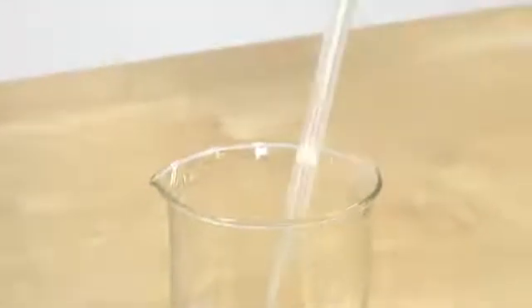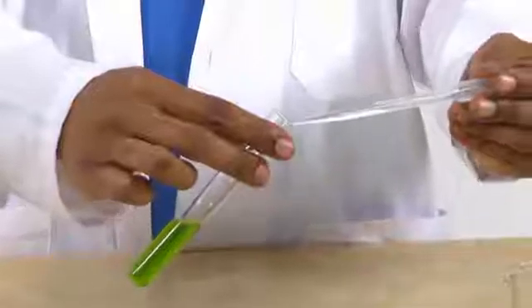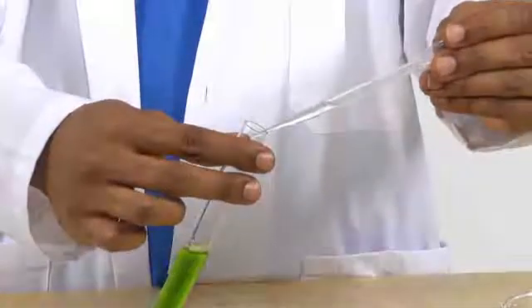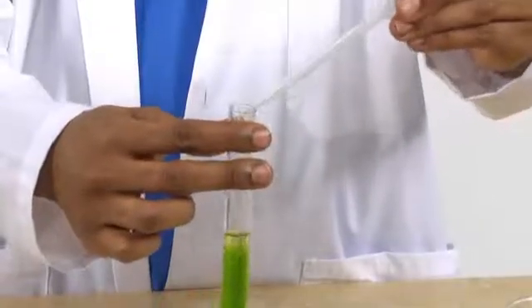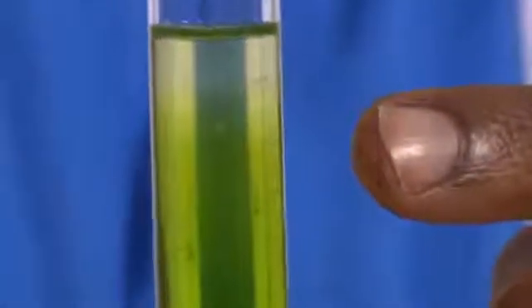Next, I'm going to measure out about two milliliters of the cold ethyl alcohol. I'm going to tilt the test tube and slowly add the alcohol so that it forms a layer on top. You see these white stringy masses? That's the DNA. Spinach DNA in a few easy steps.